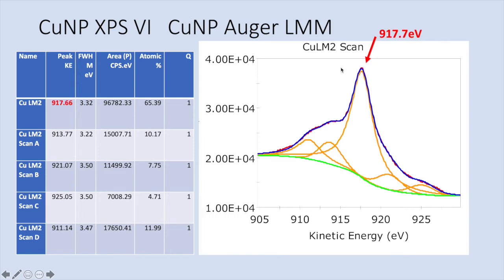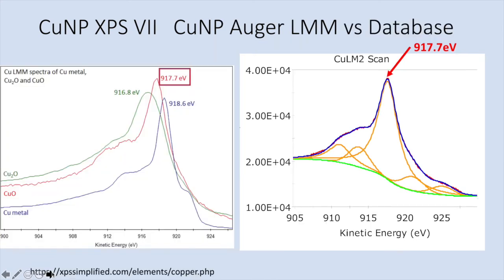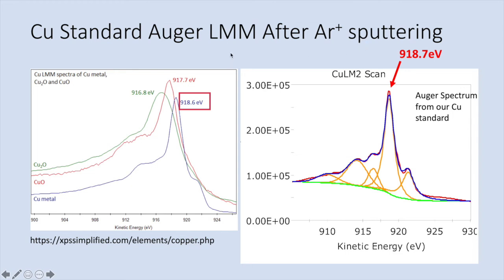Let's go to the Auger peak. Fitting the Auger from the copper nanoparticle gives a peak at 917.7 eV — an exact match to the database. We don't have any component at 916 eV. This also matches the Auger spectrum from our copper standard. The Auger peaks are more prominent here, and we have a pretty good Auger spectrum overall.